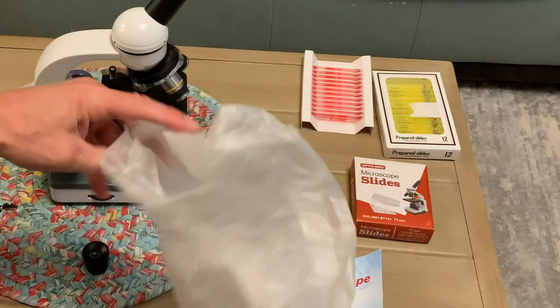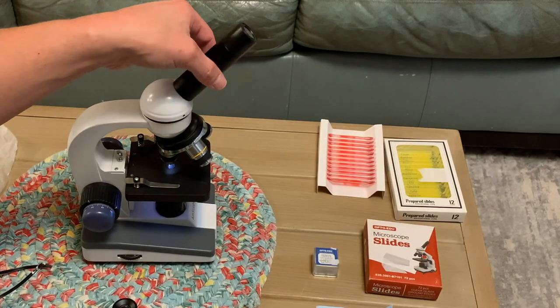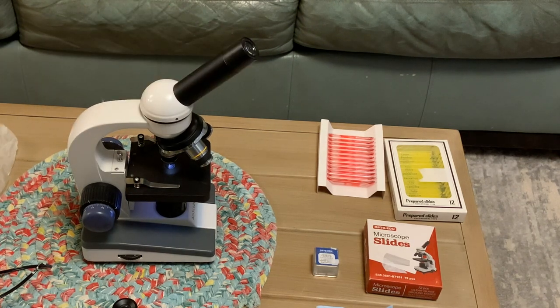It comes in this foam case and you also get this dust cover. You can see the microscope lens at the top moves so you can look from different angles or have different people looking through it, and that's the basics of how to use it.